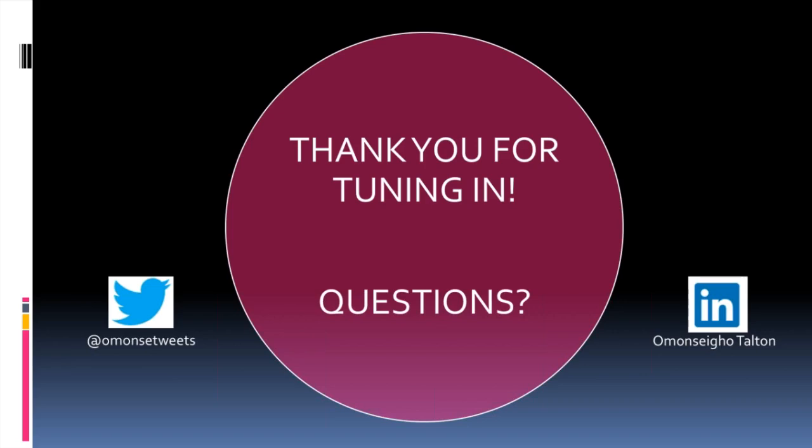Exactly. All right, let's have a look at what Benjamin is asking. Which kind of ELISA would be best in determining histone modifications? That's a great question. This is like an exam question. Yeah, it is. I'm trying to think. Okay, so a histone modification.